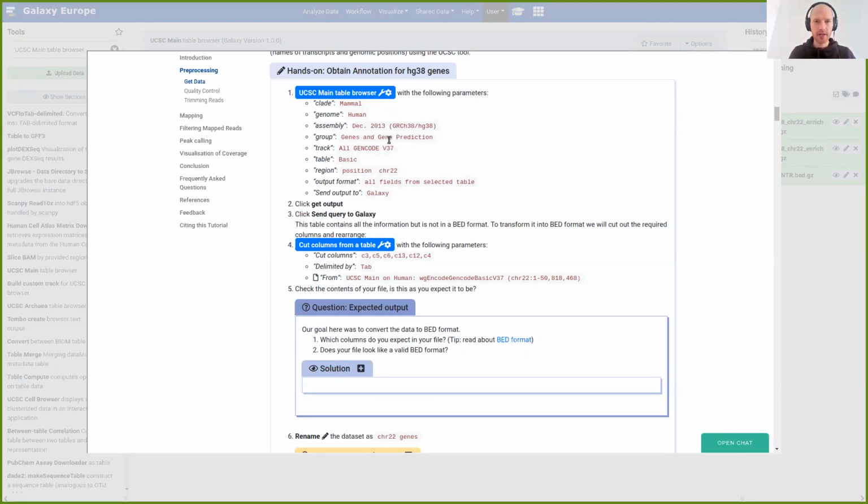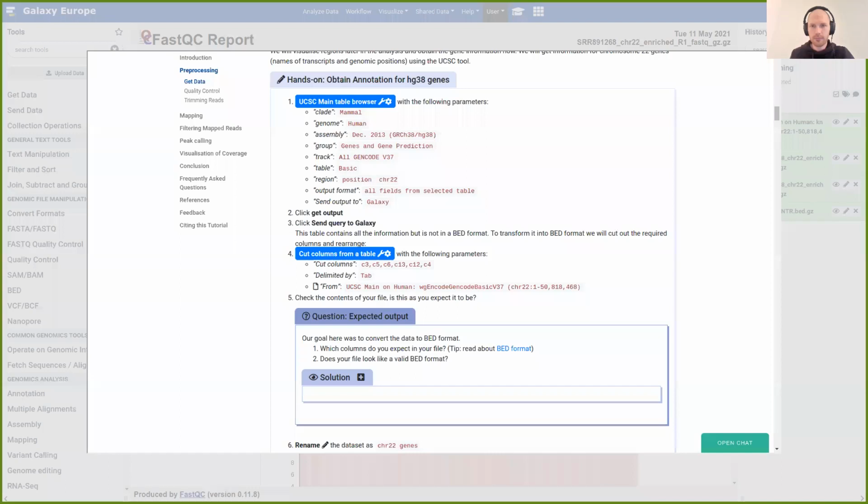And if you then follow this training based on this button in Galaxy itself, then you can immediately click on these buttons here for these tools, and then it opens directly the tool itself, just so that you understand what I'm doing right now.